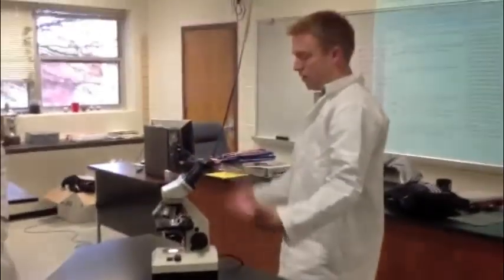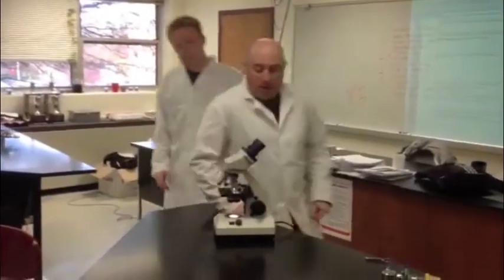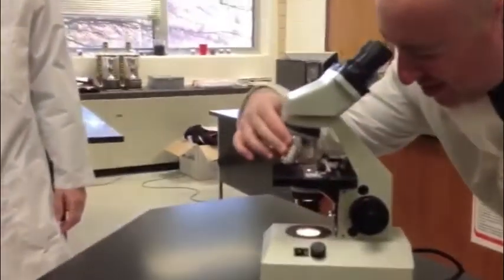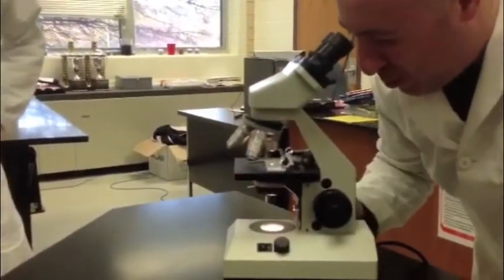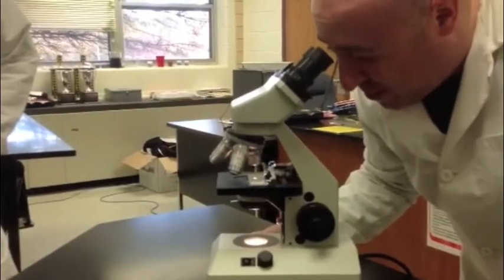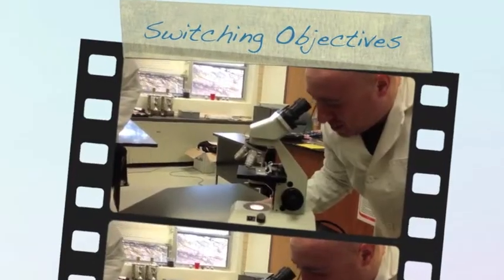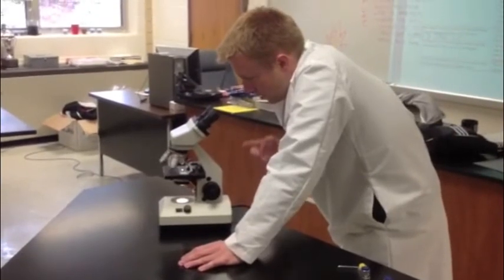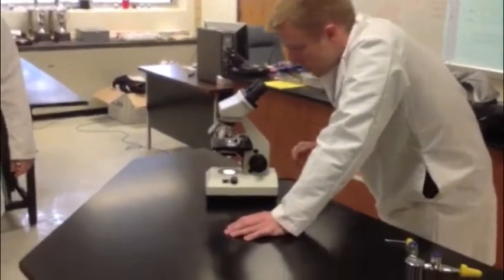Mr. Pepper, I still can't find my specimen. Where is it? Well, what's going on here is you're actually not starting in the scanning objective. You always want to make sure you start with the scanning objective and bring it to the point where you can actually see something so that you can start looking at your object. I found my specimen under the scanning objective. Now I'm going to switch to the low power.